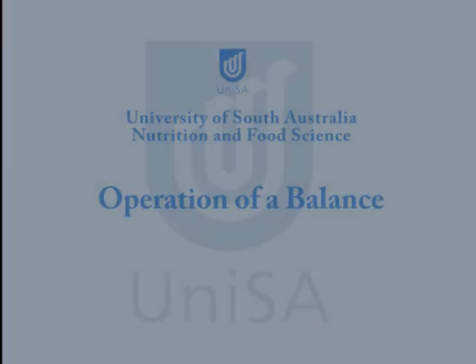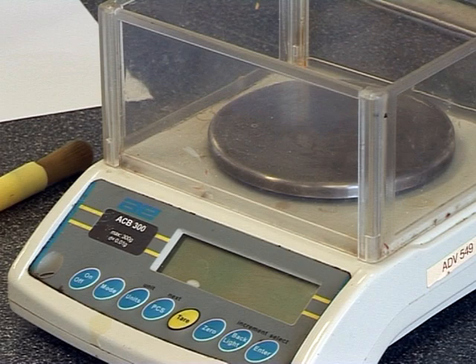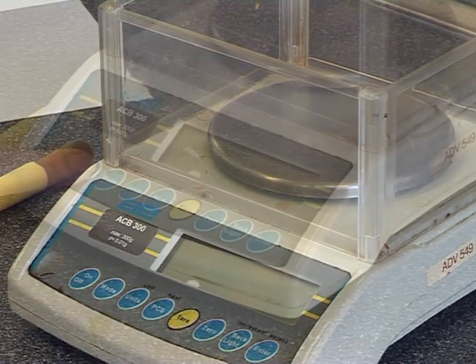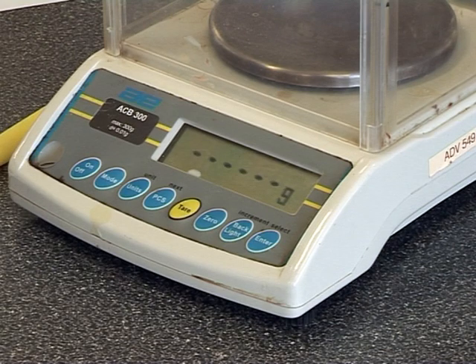Operation of a Balance. Turn the balance on by pressing the on-off button.